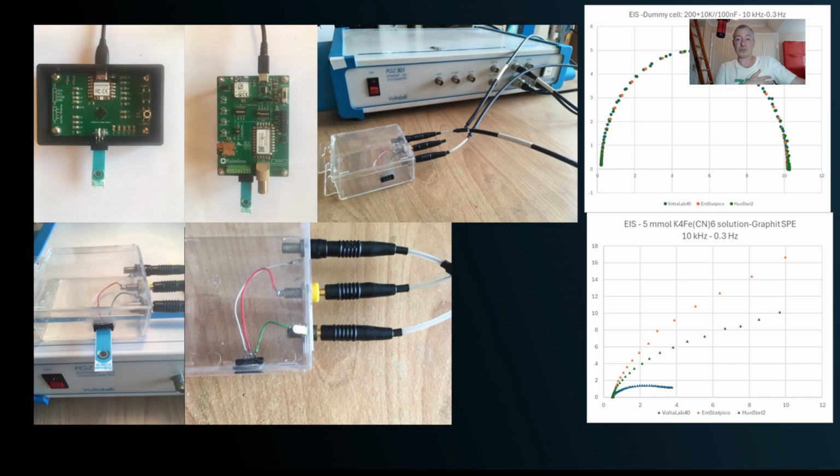So my first thought is actually the screen printed electrode is changing every time they use it. So sometimes with screen printed electrodes, depending on what you're doing with them, in the act of making a measurement, you actually end up changing the sensor itself. The idea of screen printed electrodes is really from the glucose world, where you put a sample on there, you get a result, that's it. Because in using an electrode, you can actually change its state. So when you do your first EIS and then your second and your third and your fourth, don't be super surprised if, everything else staying the same, you start getting drifting with screen printed electrodes.